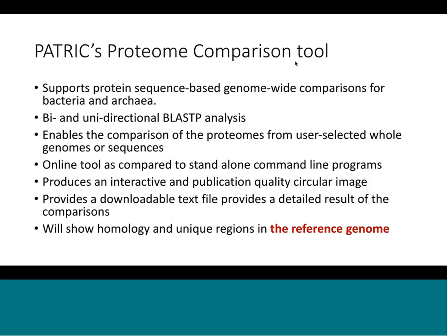Something else it does is it produces an interactive and publication quality image that you can use directly in a publication, and I'll show you some examples of that today. The thing I like best about the tool, of course I like that it's online because I'm a biologist, not a computer scientist, so I'm glad I don't have to do it in the command line, and I like the figure that it produces, but the most valuable thing to me is the downloadable text file that shows you each of the genes and the BLAST hit parameters assigned to each of them.